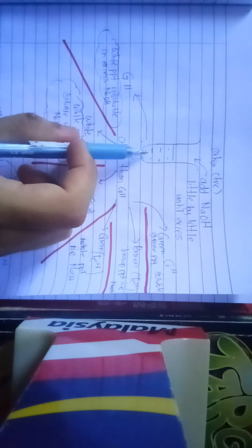What does it mean? If you put a little bit of sodium hydroxide initially, you will see the white precipitate. But if you put excess sodium hydroxide later, you will see that this precipitate will dissolve in excess sodium hydroxide. So that's how you differentiate whether this solution contains group 2 cation or non-group 2 cation.